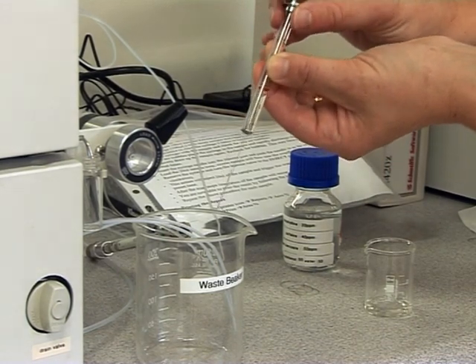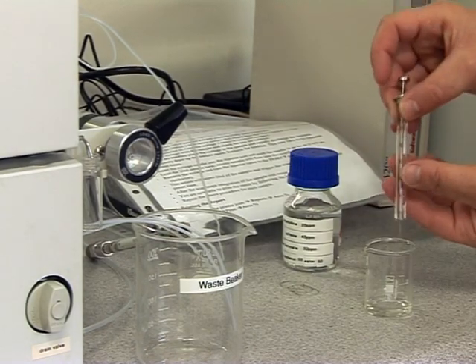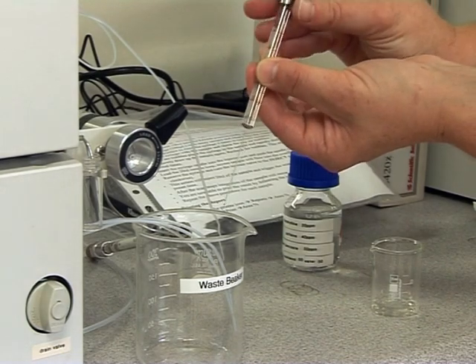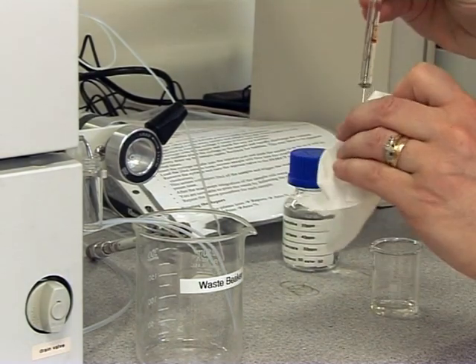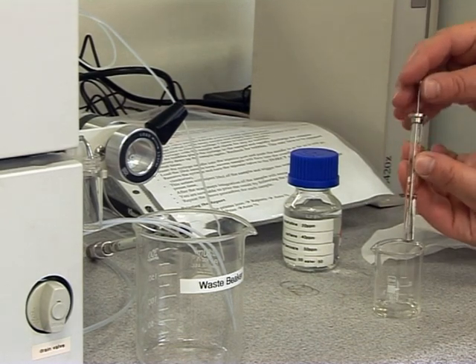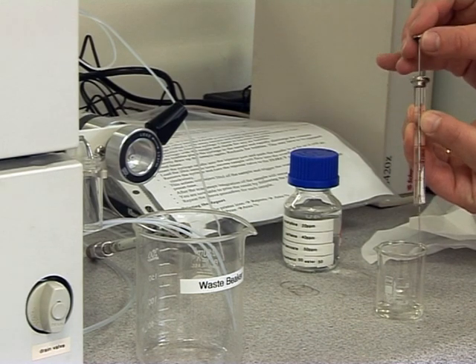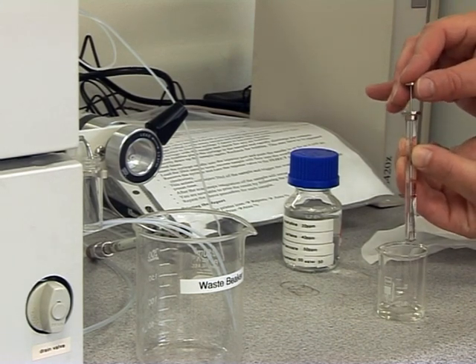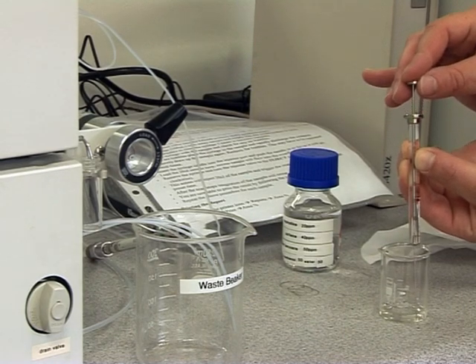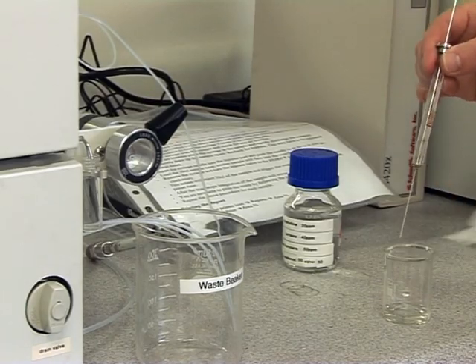Draw up approximately 50 to 60 microlitres again and check for air bubbles in the syringe. If there are air bubbles evident, you need to remove them, as they will cause interference in the analyses. To remove air bubbles, place the tip of the syringe into the solution and push the plunger down quickly. Draw up the solution slowly, and if the air bubbles are still there, push the plunger down fast again. Repeat this process until the air bubbles have been removed.